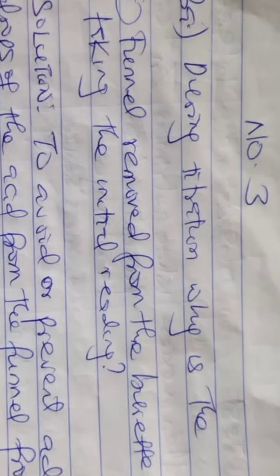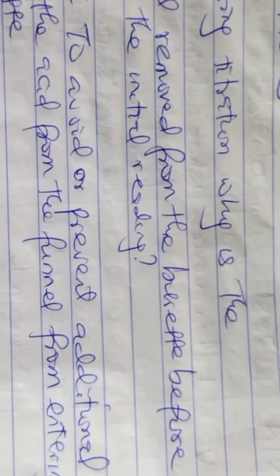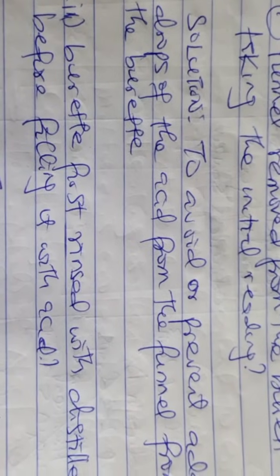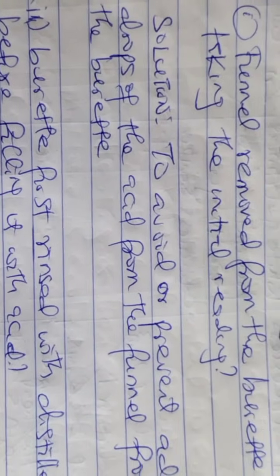Question 3AI says, during titration, why is the funnel removed from the burette before taking the initial reading? Solution: to avoid or prevent additional drops of the acid from the funnel from entering the burette. So that's why the funnel is removed before taking the initial reading.